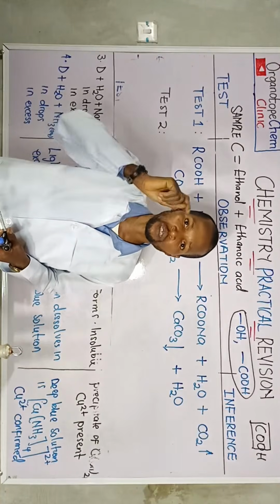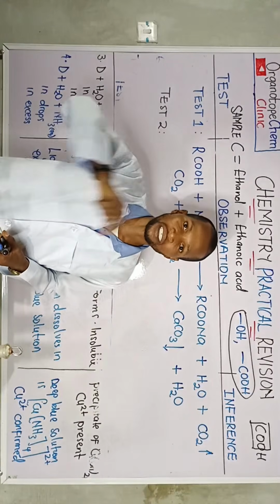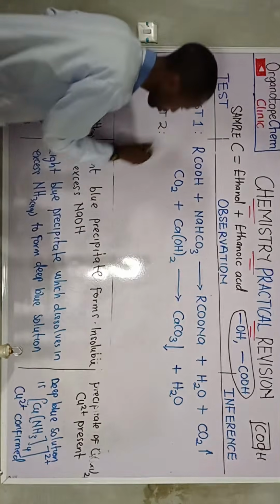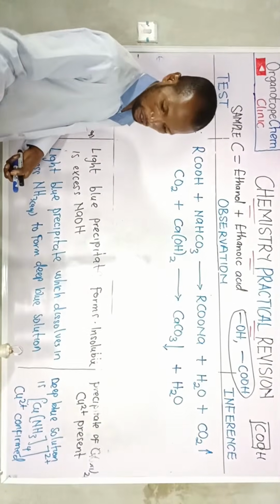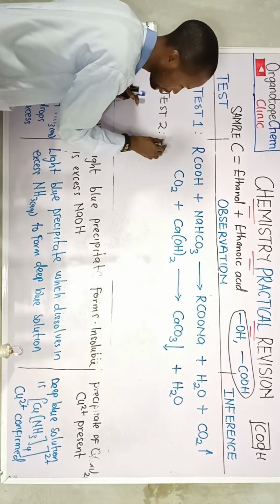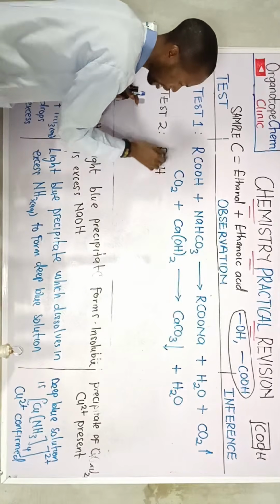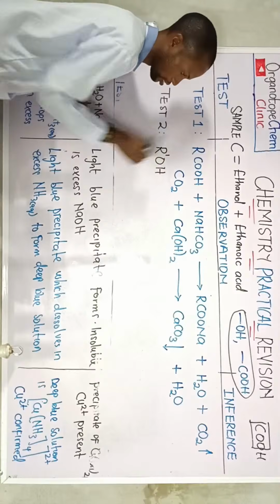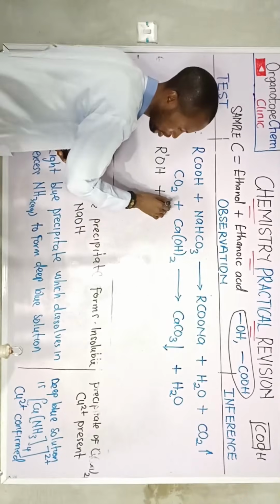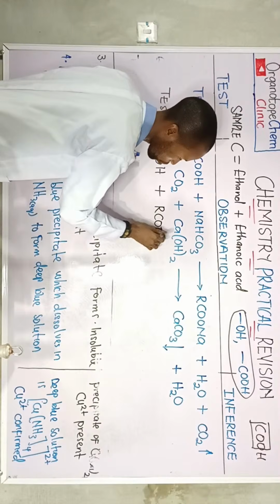That shows that something has been revealed to you. They tend to mark you wrong. If you are stating a specific compound, you will be marked wrong. Okay? So we have ethanoic acid added to sample C. We have an alcohol, and I write that as ROH. Okay. We have ROH plus the 6 molar ethanoic acid, but we are using the general alkanoic acid, RCOOH.